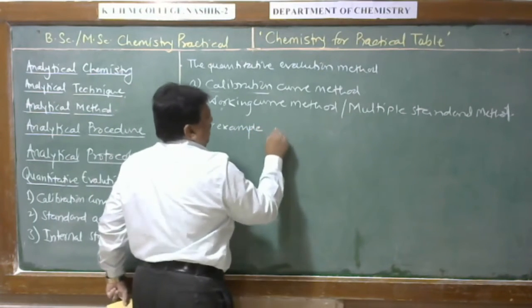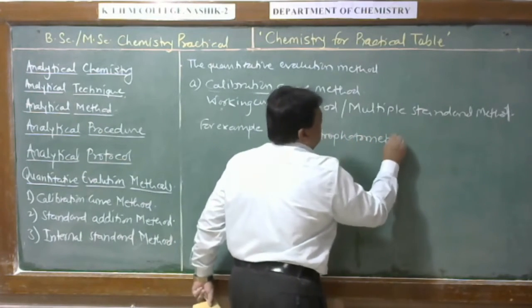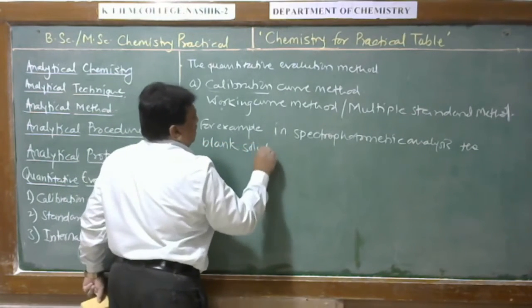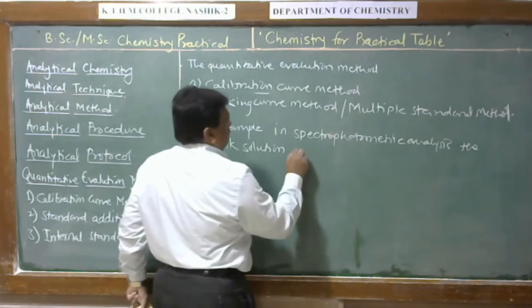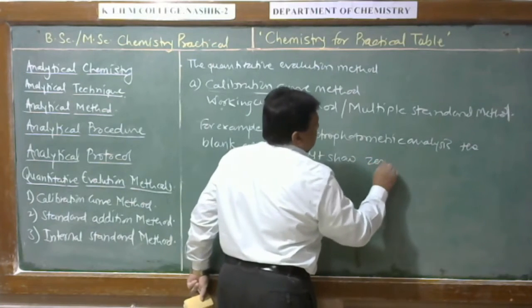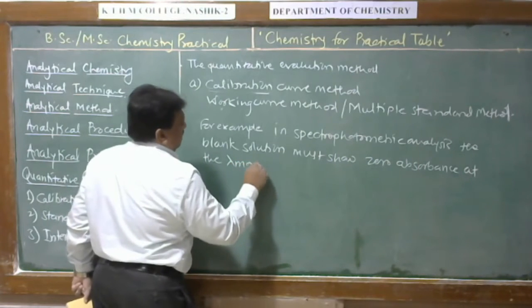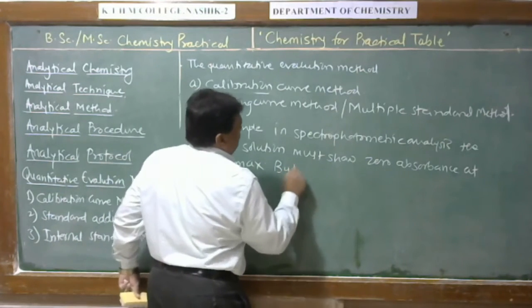For example, in spectrophotometry analysis, the blank solution, that is a solution containing all components of the sample except the analyte, must show zero absorbance at lambda max, that is the wavelength of analysis.